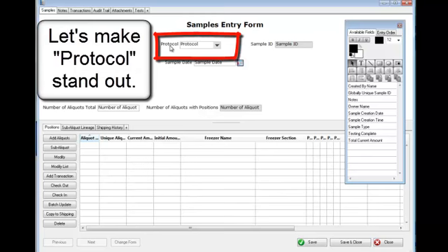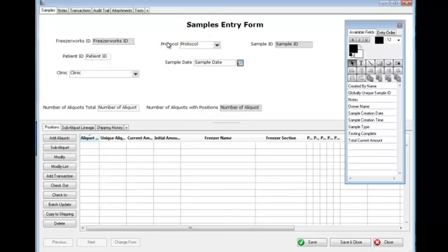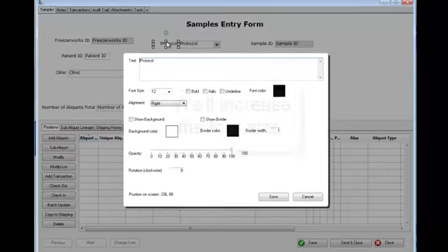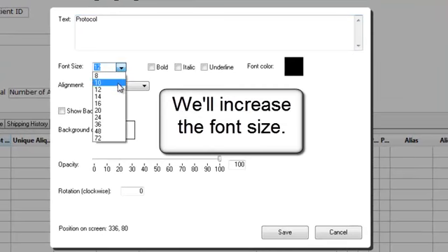Let's make protocol stand out. We'll increase the font size.